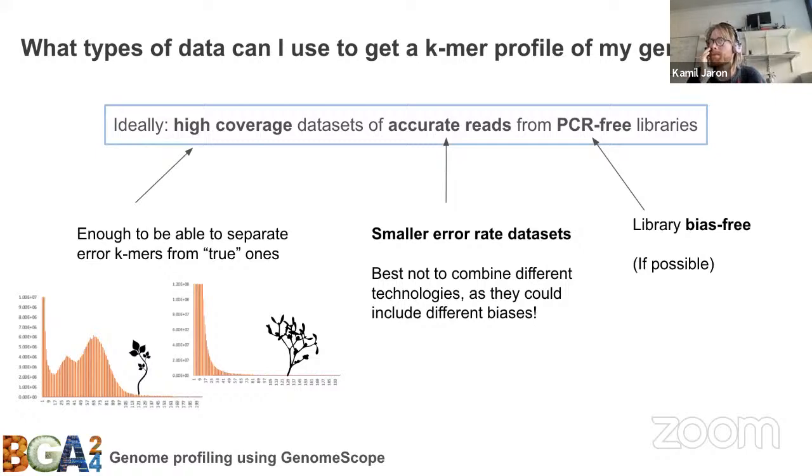You can use any type of data for this kind of profiling, really, but most of the profiling techniques require high coverage. It's good to have accurate reads. If you're taking old PacBio data that used to have very high error rates, which you probably don't remember anymore, then it just looks bad. It's really just a function of the fraction of errors. If the error rate is over 1%, then it's becoming a big mess.